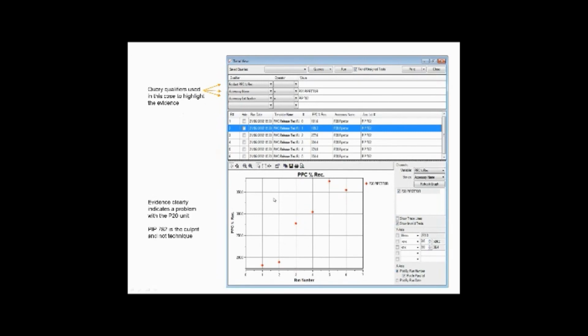And this type of investigation and the documentation you can produce with it does make it very easy when it comes to a potential audit, if this is spotted during an investigation, to show what steps were taken to analyze and isolate the problem and potentially to introduce steps to deal with it. So that really highlights the power of having a structured query language database to access and isolate the information we want in all of that data that's generated on a day-to-day basis.